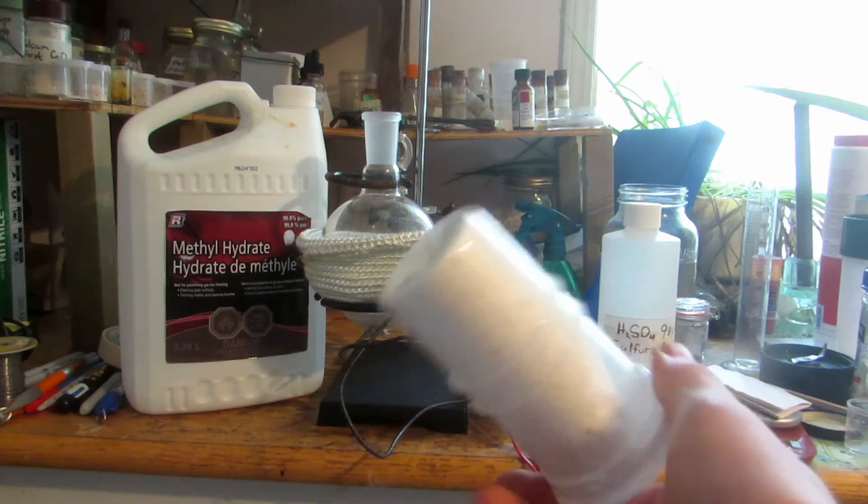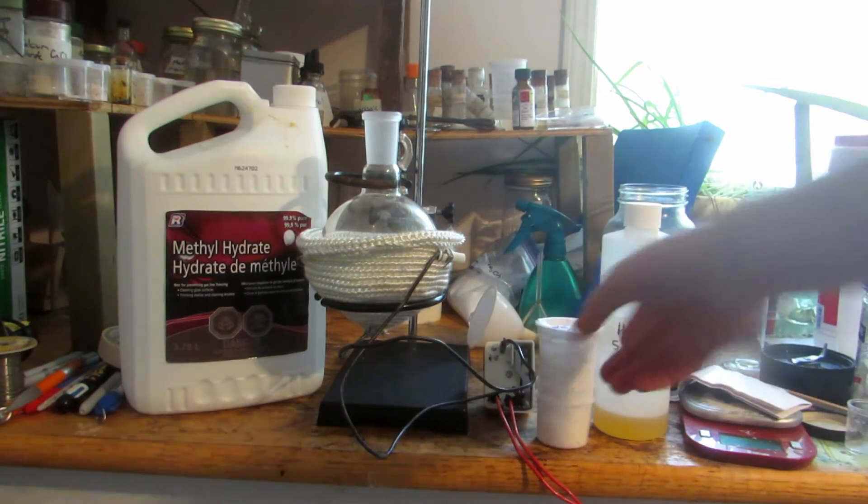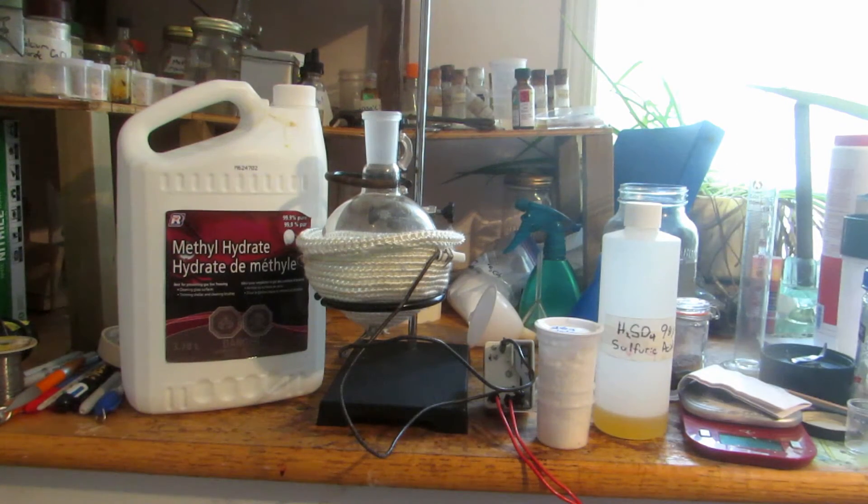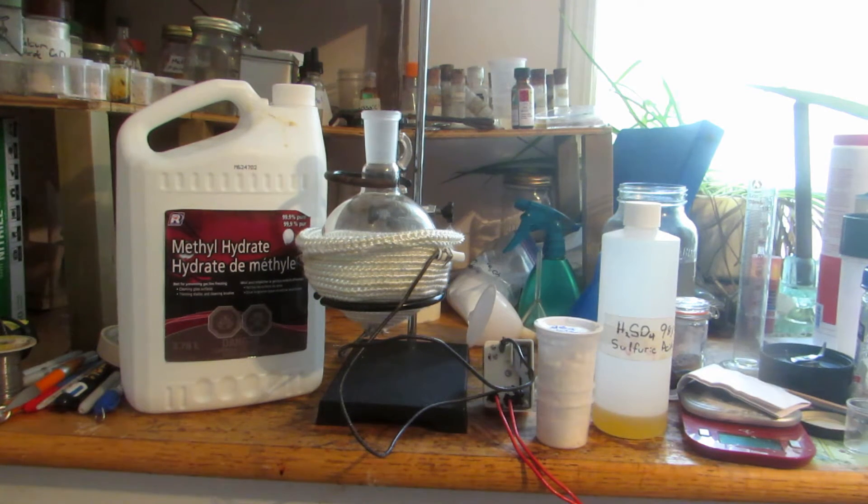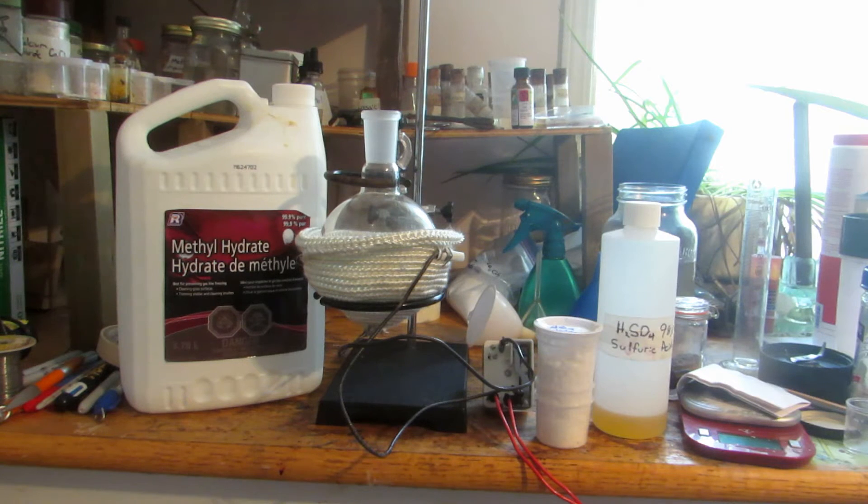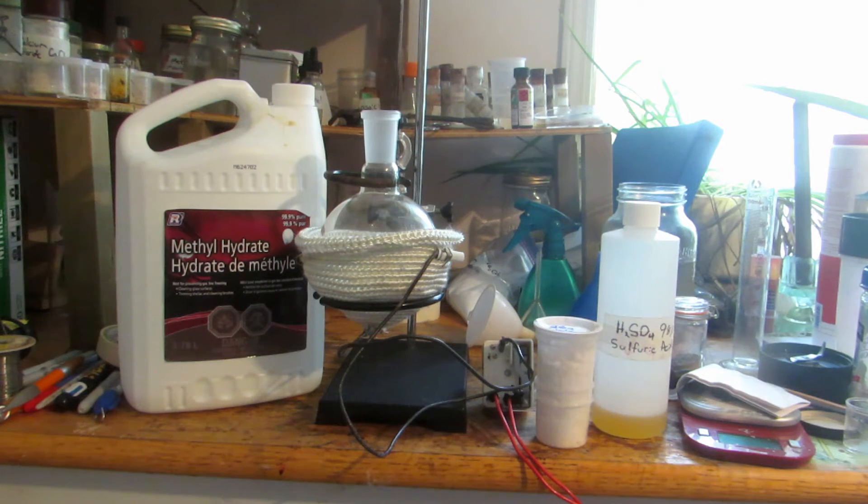I used most of the salicylic acid to make phenol in a previous video for other applications, but I saved 20 grams because I wanted to make a chemical known as wintergreen.